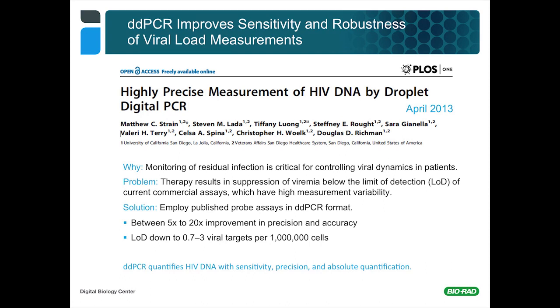So people have struggled to try and make the most sensitive measurements possible to determine if a patient is really totally free of the virus or not. And in these efforts, they are always looking for means by which they can more sensitively detect the presence.